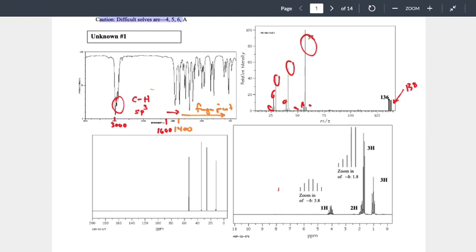So all these individual things or peaks are parts of the exploded molecule. It's what's known as the fragmentation pattern for mass spec. It is incredibly powerful, and industry uses it a lot. Okay? The problem with it is it takes a lot of time to build it through, and we don't have enough time to really evaluate that fragmentation pattern.